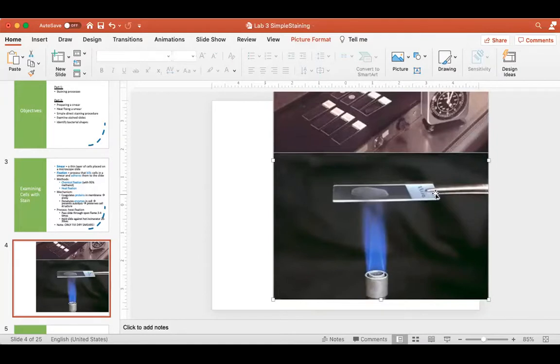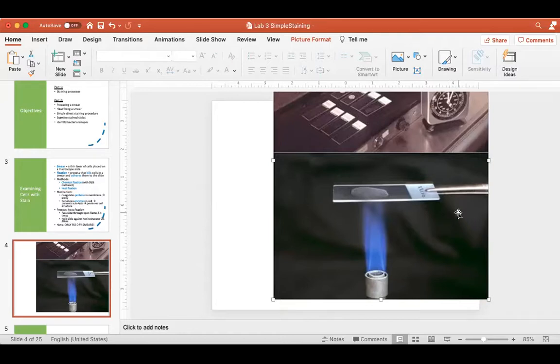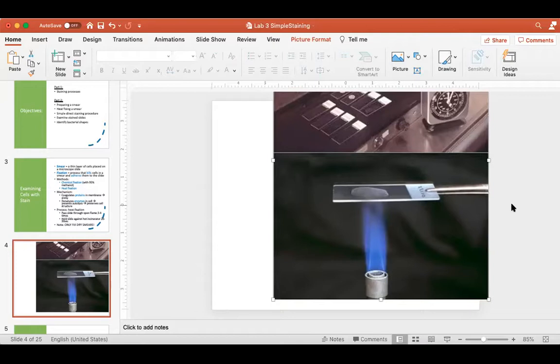When heat fixing you would never just leave the slide there over the flame — you would pass it across the flame, right over the tip of that inner blue cone, once, then twice, then three, maybe four times, and then you're done. That's all you need — enough heat to cause those proteins to get sticky and adhere to the slide.